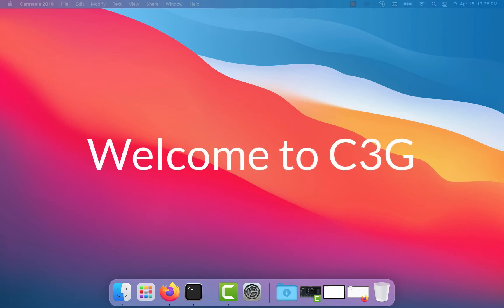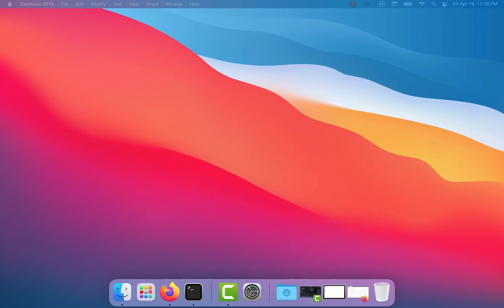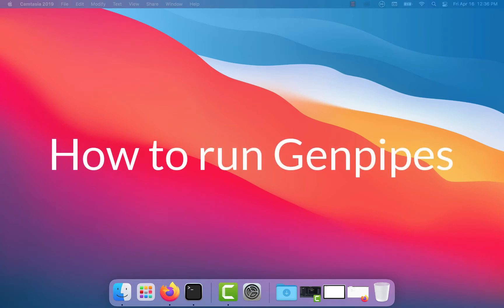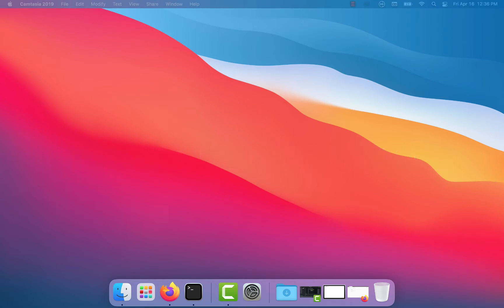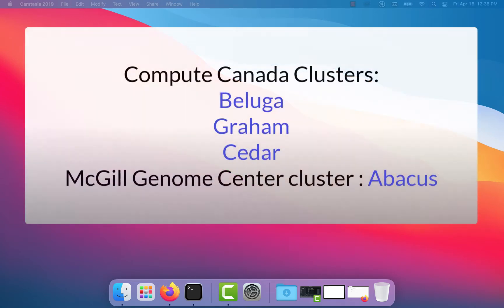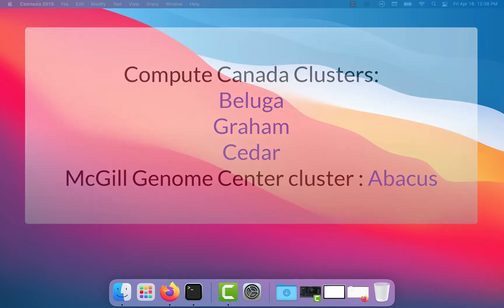Welcome to C3G. In this video I will show you how to run GenPipes on a Compute Canada cluster. If you are working at the McGill Genome Center you can also run GenPipes on our own cluster Abacus.